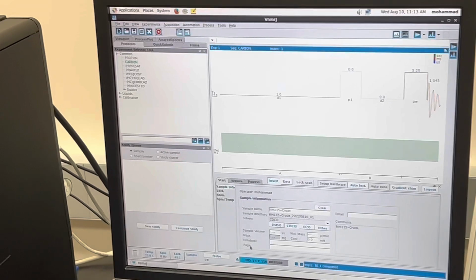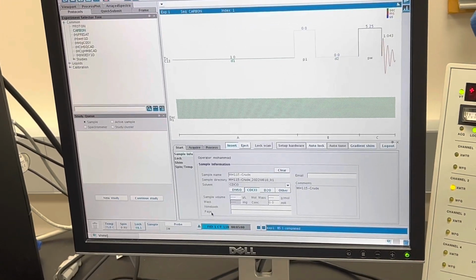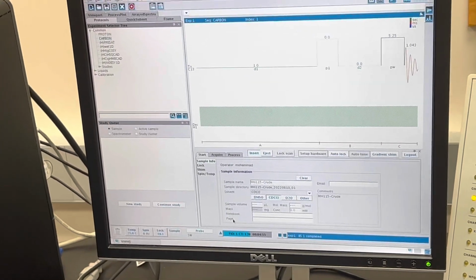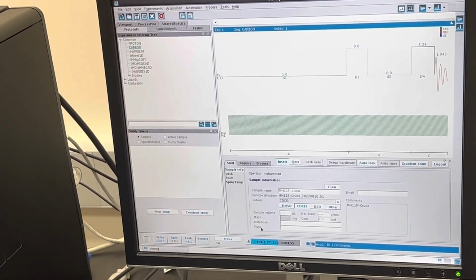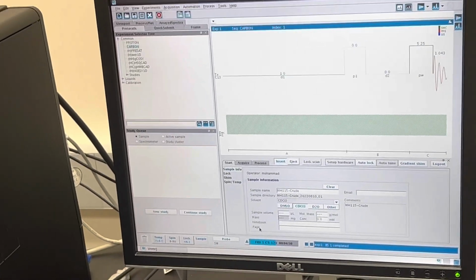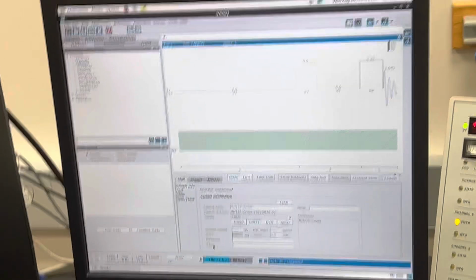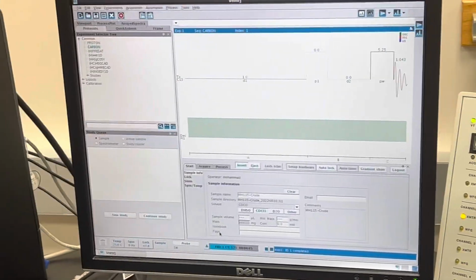That's one of my first recommendations. For a 10 minute carbon it's okay, it just wastes 10 minutes. But sometimes you want to run a carbon for 2 hours, 3 hours, 4 hours, and you don't want to spend 3 hours and get nothing because it failed. It happens.